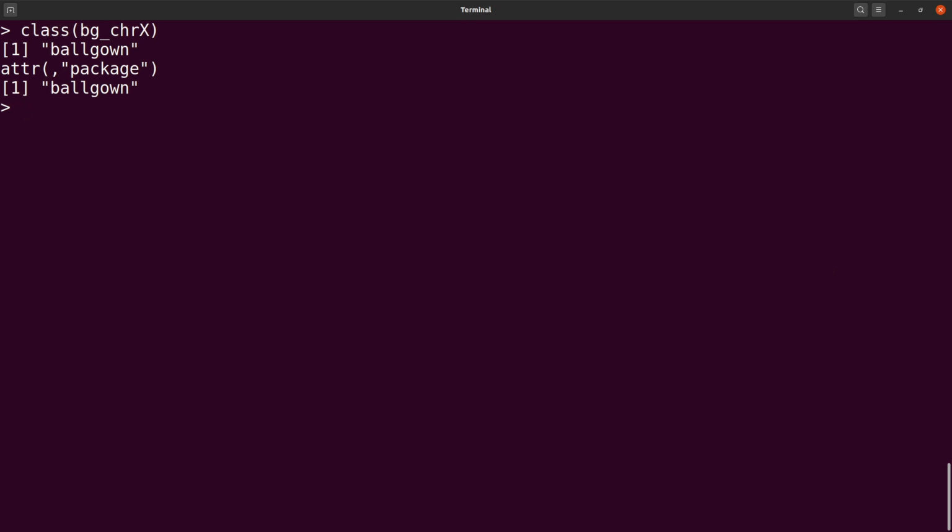Now let's proceed. You may have realized that I have been using the chrx a lot, and that is what was also being used in the original tutorial. This is because we are dealing with the human transcriptome, but the data has been downsampled, so it's only the chromosome X samples that are being used. It's just a way to help beginners get their hands dirty with RNA-Seq analysis using an ordinary PC or an ordinary laptop.